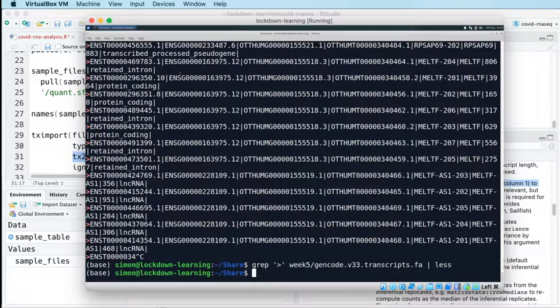Okay, so the commands for extracting the information, first of all, are both grep. So we run grep. We want to turn Perl regular expressions on, so that's a -P. We want only the text that matches our expression to be retrieved. So we don't want the whole line, we just want the text that matches our Perl regular expression. And then we want to define our regular expression.